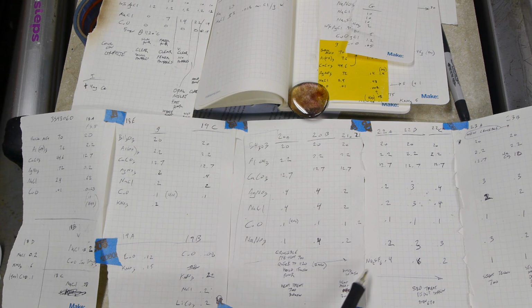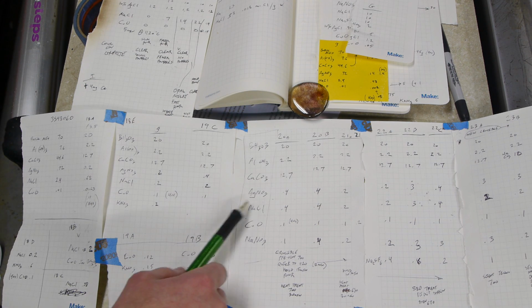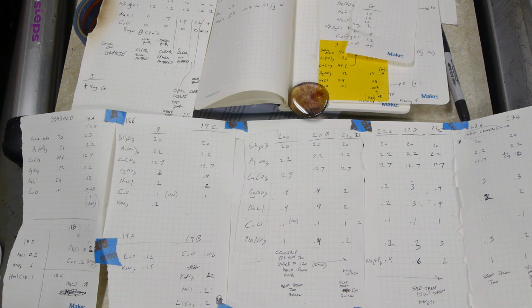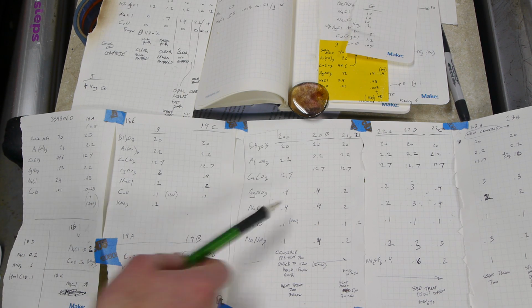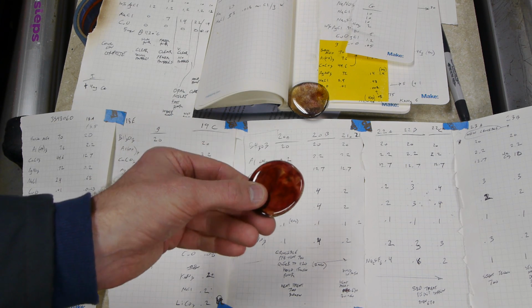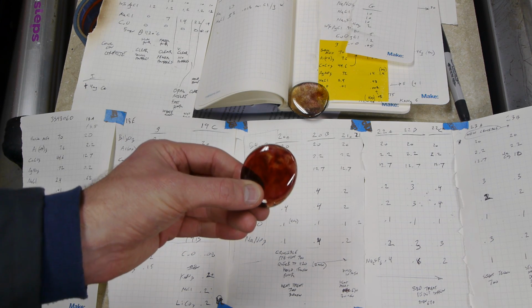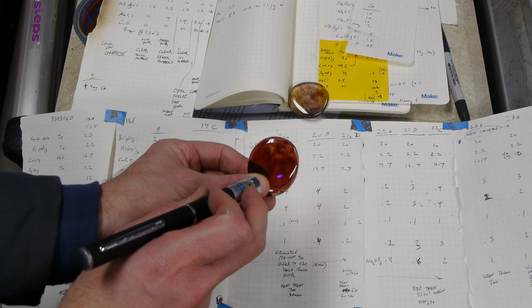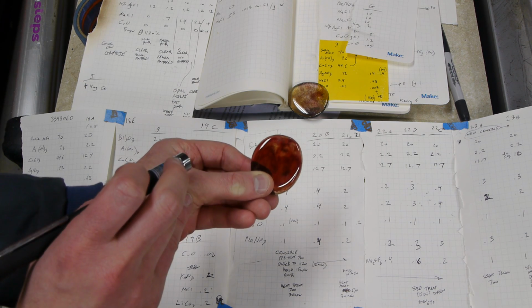If you don't want to add the fluorides, you have another option to create these nucleation centers. What you can do is just keep adding so much silver nitrate that eventually all the silver chloride that's going to form has formed, and then there's actually excess silver left over. The excess silver will just hang out in the glass, so it actually starts out kind of dark. Basically, the silver provides its own nucleation centers. And this one is actually photochromic as well.